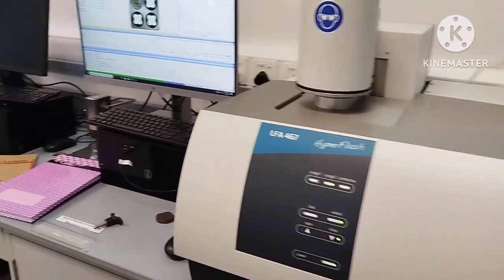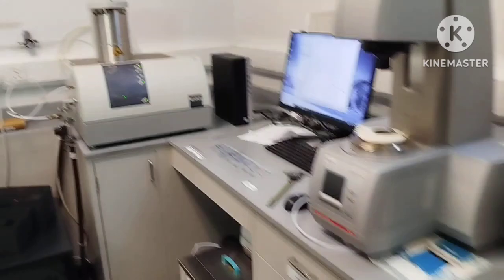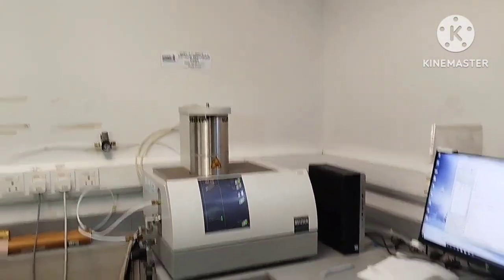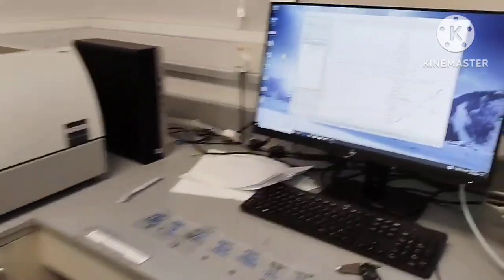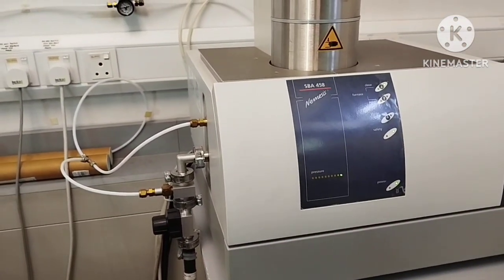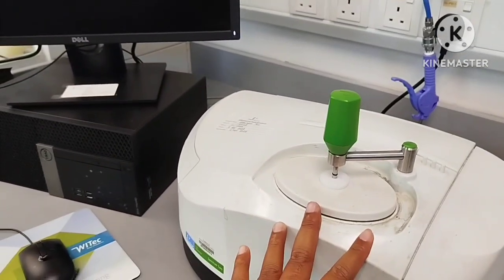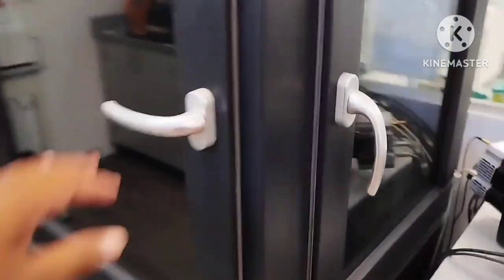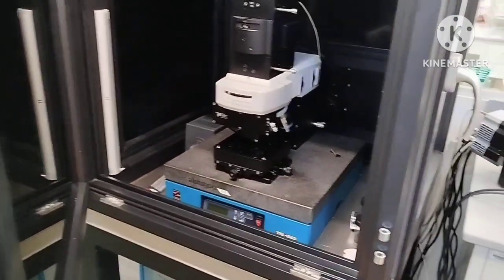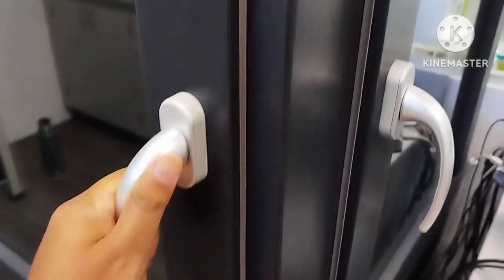So they got the hyperflash to measure the thermal conductivity, thermal diffusivity, and also Seebeck coefficient, also important for what we call thermoelectric. So here you can see they are measuring the electrical conductivity, the Seebeck coefficient. So their measurement is still going on. I'm surprised they run overnight. So we got the FTIR here to run the functional group. And we have Raman equipped with AFM. So this is Raman equipped with AFM. It's quite expensive, a little bit more than 1 million.